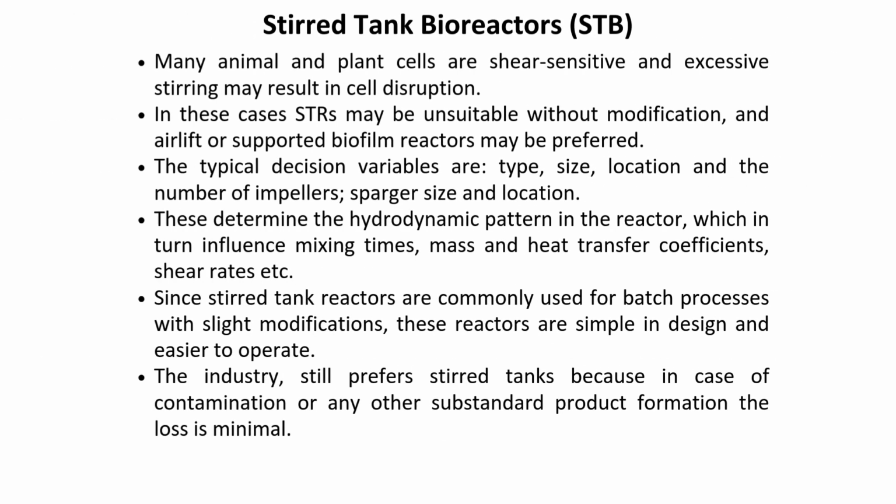Many animal and plant cells are sensitive to shear, and excessive stirring can disrupt or even break these cells. In such cases, standard stirred tank reactors may be unsuitable without modification. For shear-sensitive cells, airlift reactors or supported biofilm reactors are often preferred.